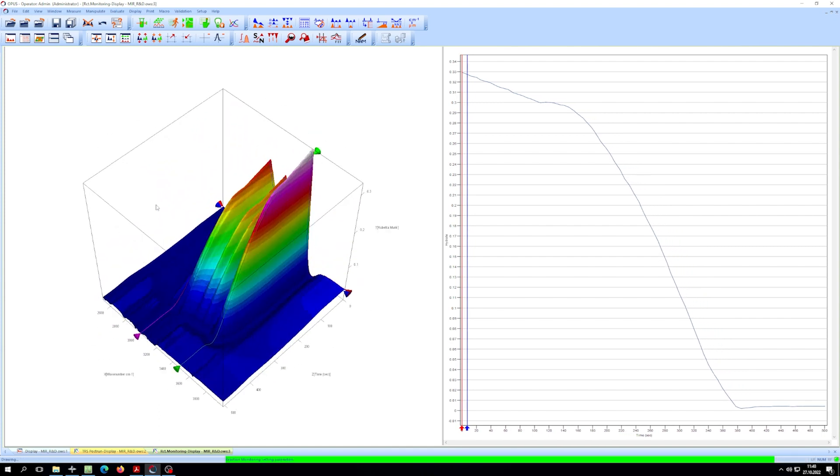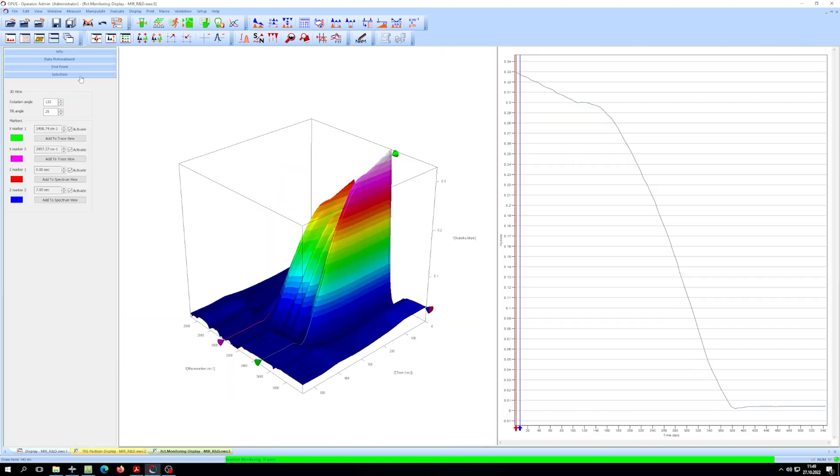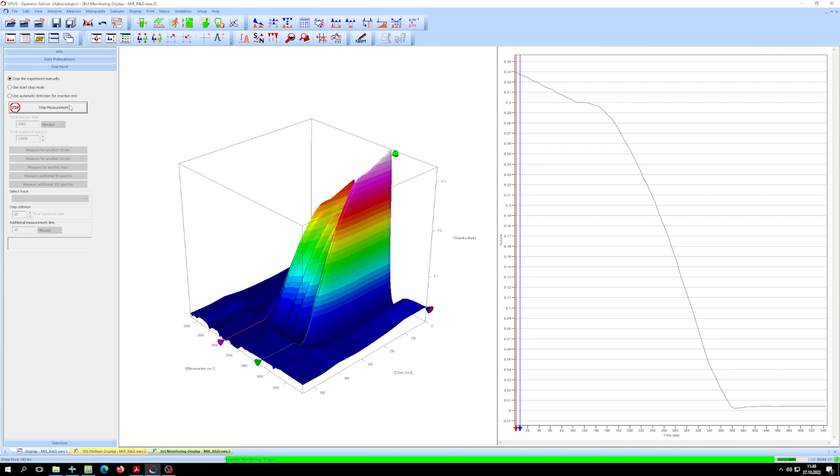You can rotate the 3D plot during the measurement to observe the spectra over time more closely, until you are sure the reaction is over. Then, you can manually stop the measurement. The data will be automatically saved, including all spectra and trace information.